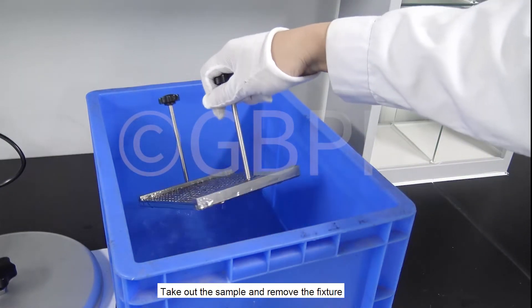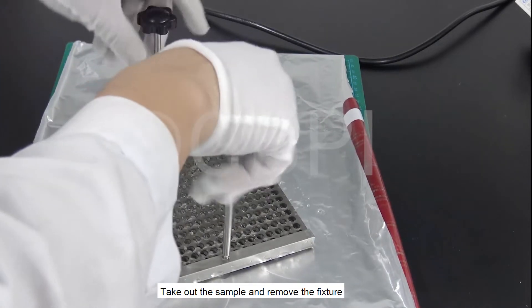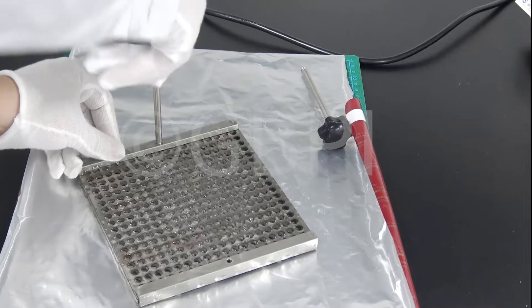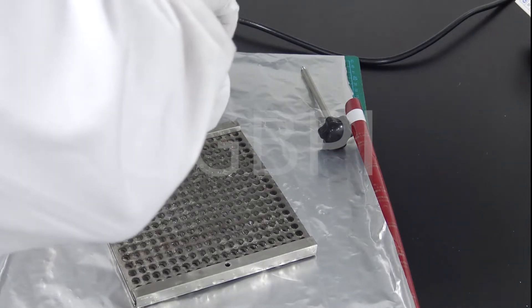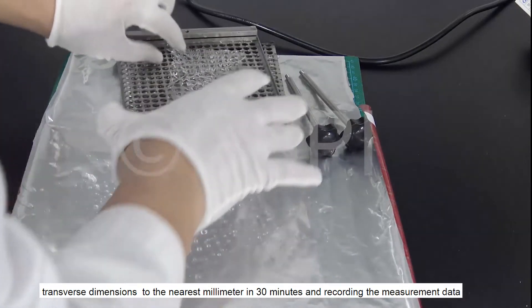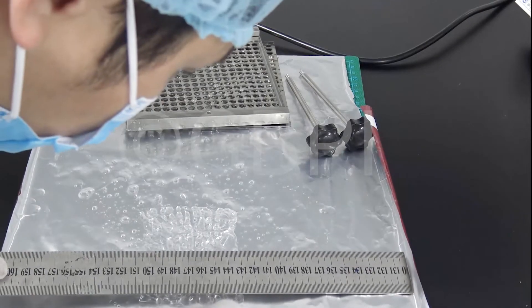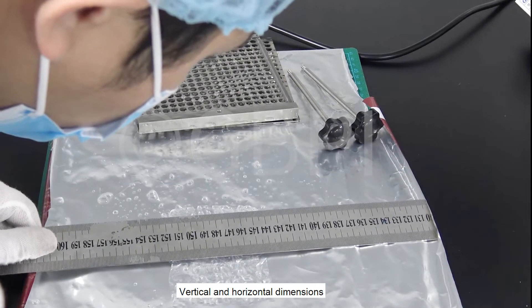Take out the sample and remove the fixture. Allow horizontal standstill, then measure the longitudinal and transverse dimensions to the nearest millimeter within 30 minutes and record the measurement data — both vertical and horizontal dimensions.